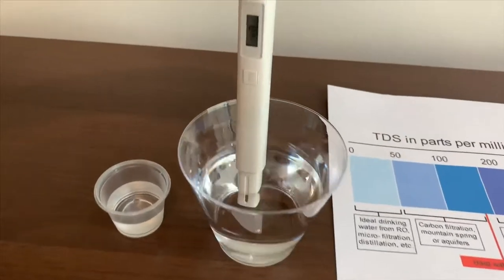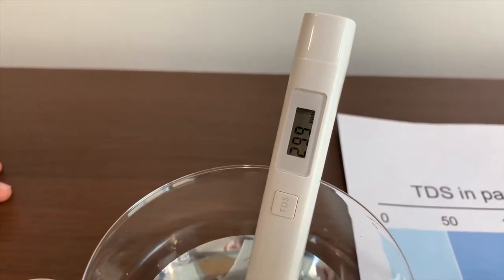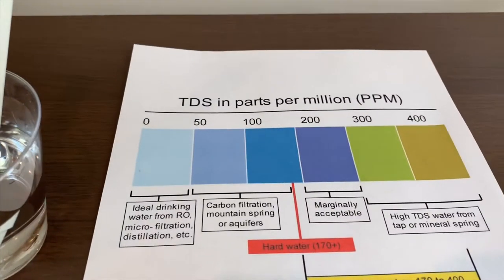Put it in and that's it. The reading is 299 — that is high TDS. Now let's test the pH level.